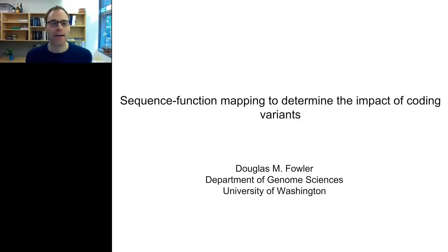Today I'm going to speak about a problem that my lab spends a lot of time thinking about, which is how to connect the sequence of a protein to its function and what implications that connection has for variants that we find in human genomes.